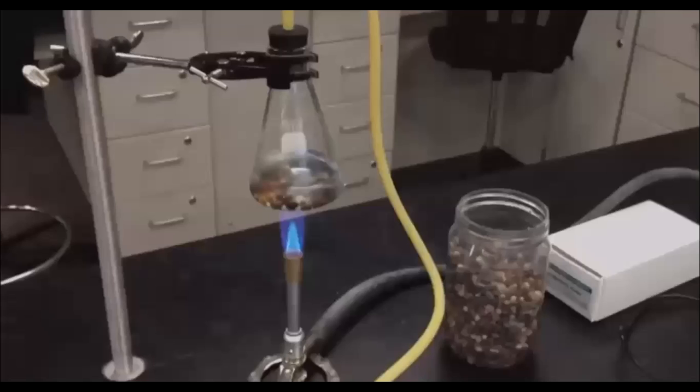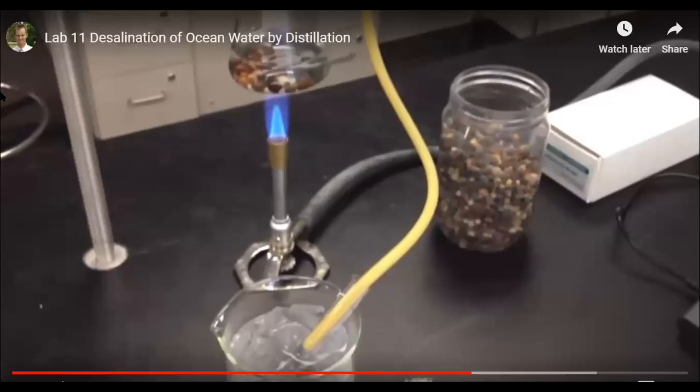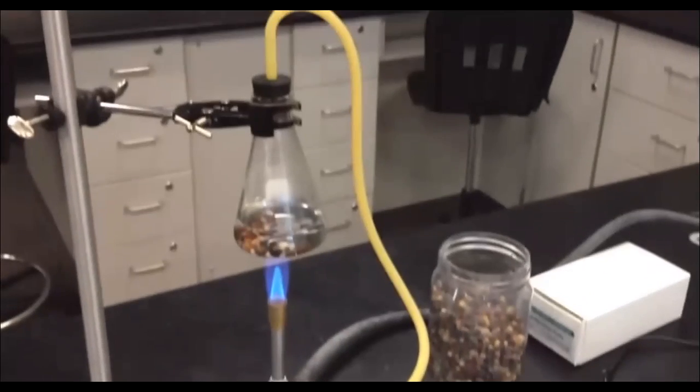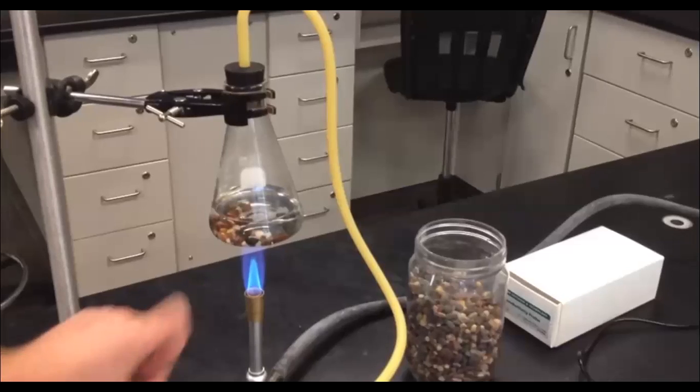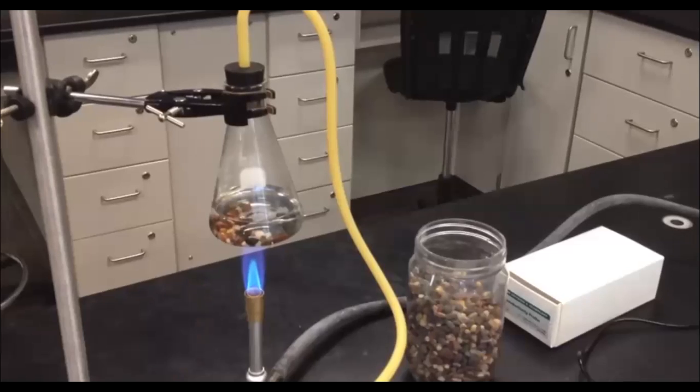Go ahead and begin heating your salt water, making sure that everything looks good. Okay, this tube should be going all the way down without any kinks in it, all the way into your clean collection test tube, which is in the ice water bath. You want kind of a nice medium controlled flame so that things don't get out of hand.